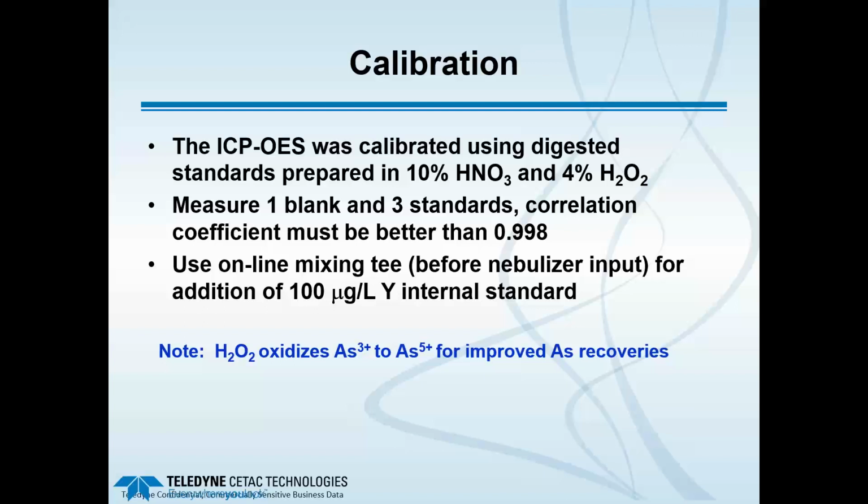We used an online mixing tee before the nebulizer input for an online addition of an internal standard. And in this series of tests, we used the element yttrium, and we teed in at a concentration of 100 ppb or 100 micrograms per liter.